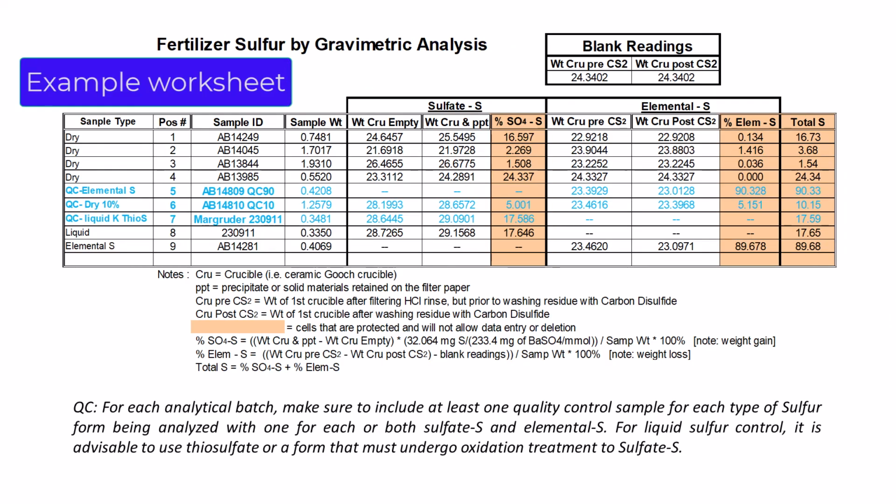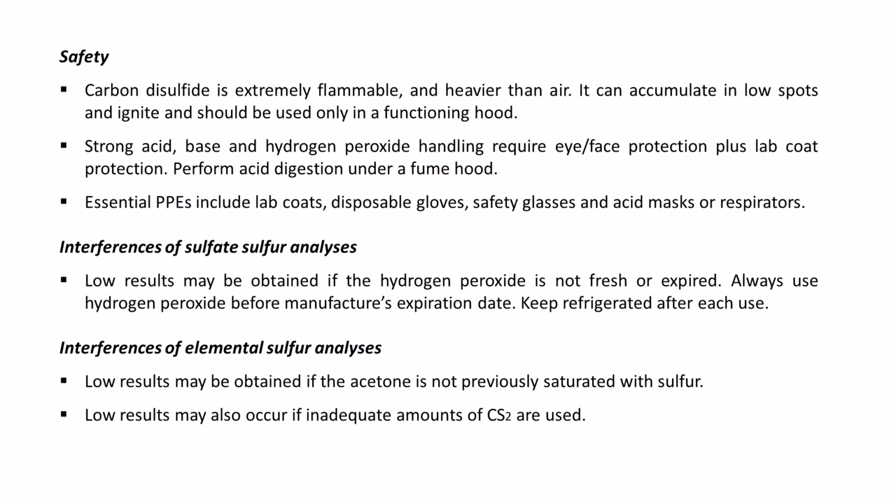The following is an example of a spreadsheet calculation and quality control considerations. Finally, here are some important safety considerations and potential sources of low recoveries.